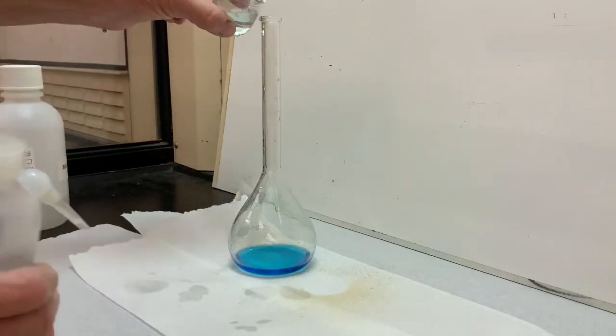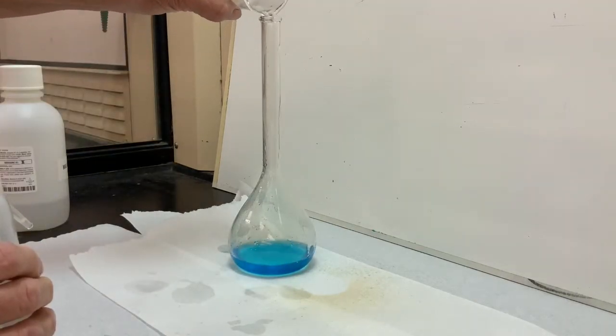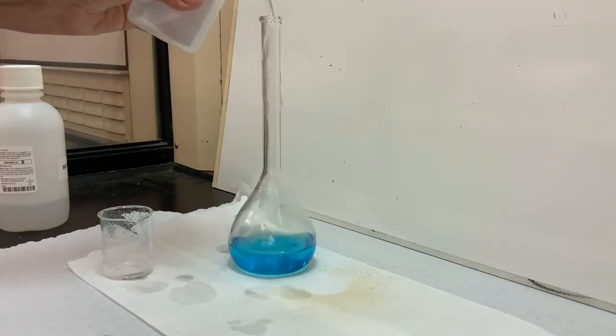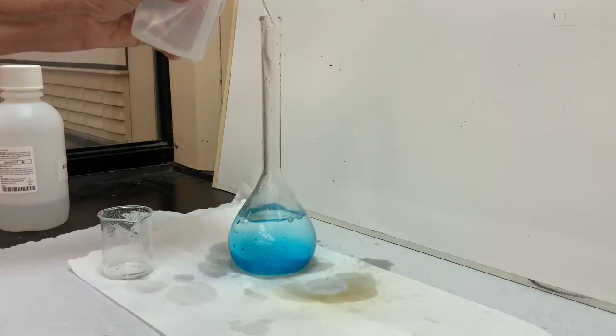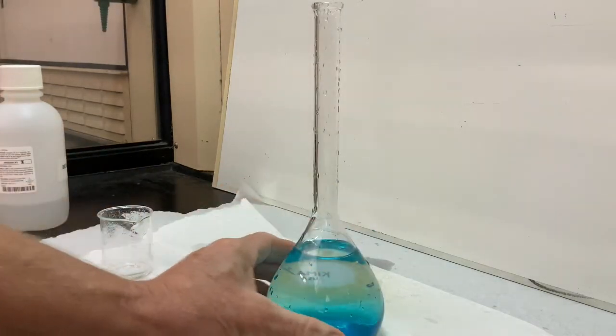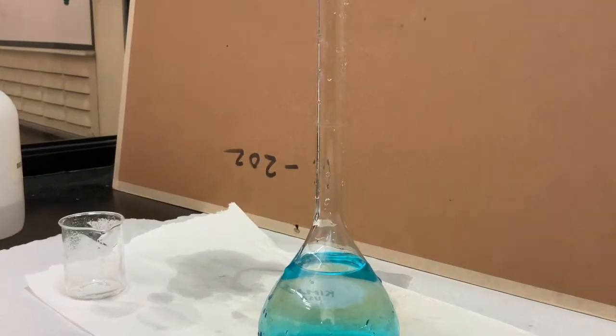It's important to rinse the beaker and make sure that all of the copper ions make it into the 250 milliliter flask, which then will be filled to the line, which is hard to see with the white background. So I'll change that background to the other side of the whiteboard.